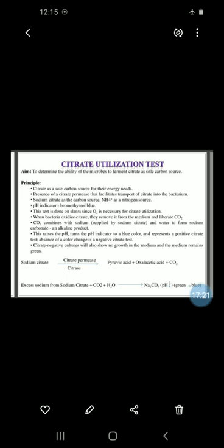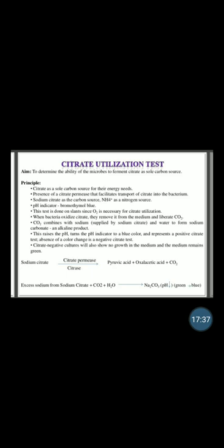When bacteria oxidize citrate, they remove it from the medium and there is liberation of CO2.